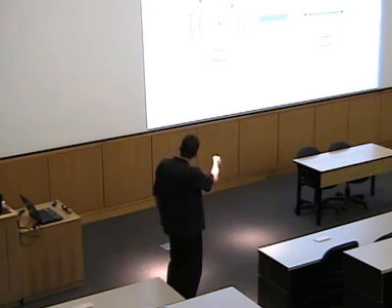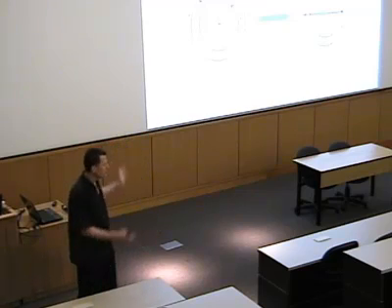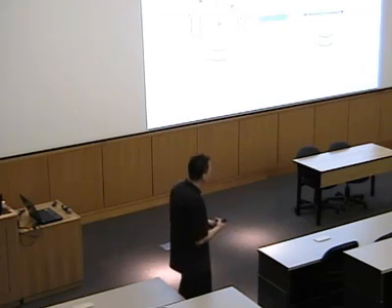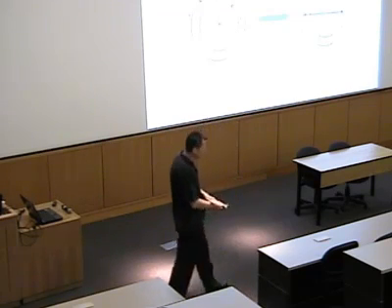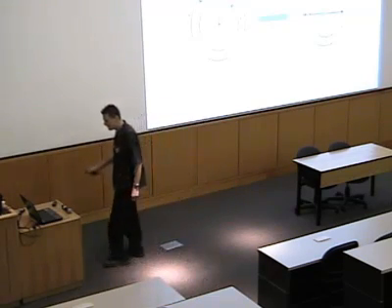And so if I follow now this blue vector here, as it moves around, it gives me something that looks like this. So I go from linear polarized light to elliptically polarized light, right? By just absorbing the left and right circular polarized light beam in a different way. They add up like this. And this is a nice demonstration that maybe this model, right, this model to think about linear polarized light is not so far from the truth, because otherwise, how do you explain this? Right? How do you explain to go to elliptically polarized light?